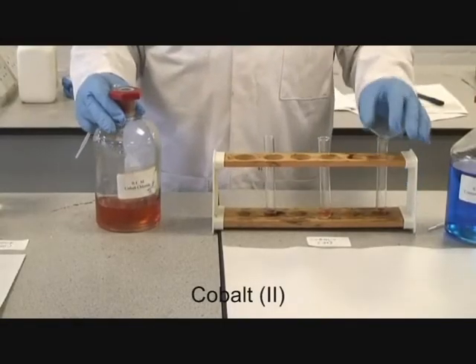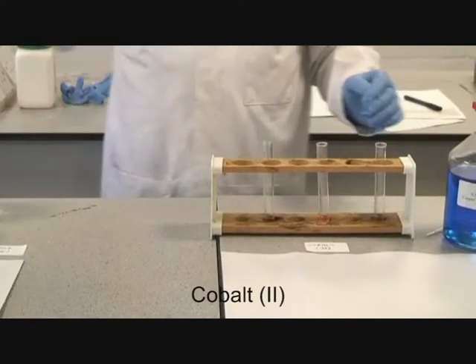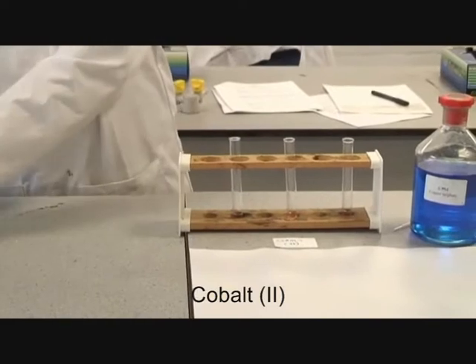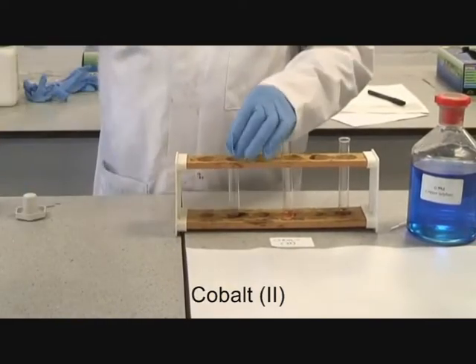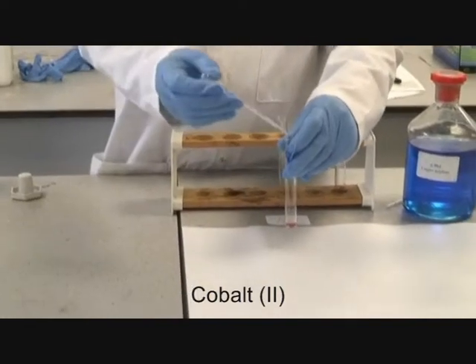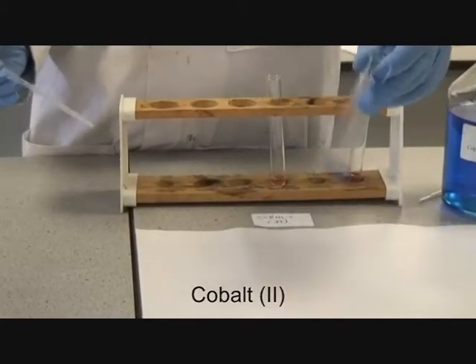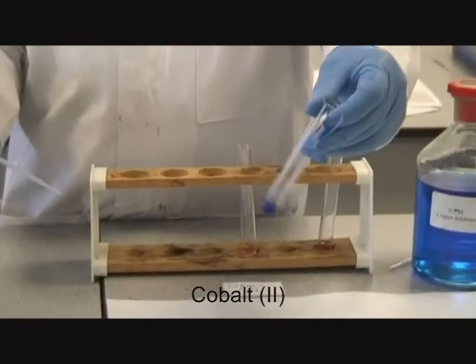It's cobalt-2. You'll see this is a pink solution, and initially we shall add dilute sodium hydroxide to it. Immediately you get a royal blue precipitate.